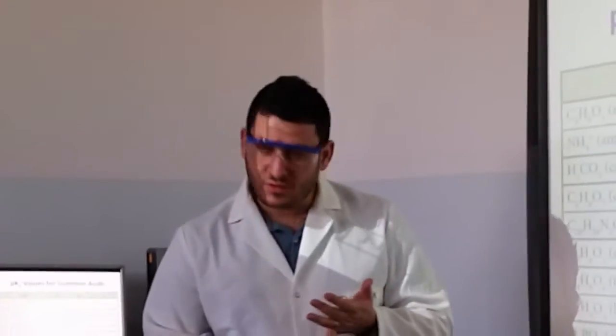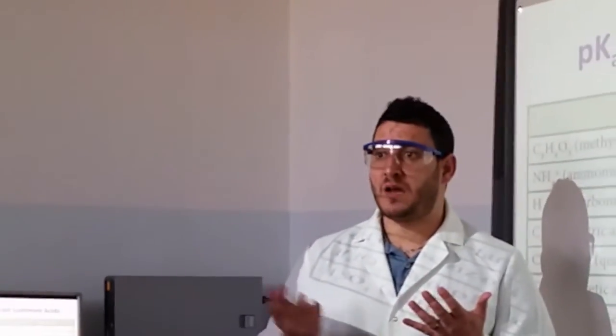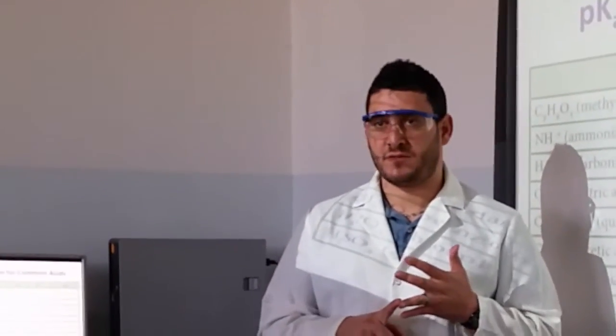You have to answer later on the questions about, does this household product contain a buffer solution or not? And what is the type of the buffer solution that you have?